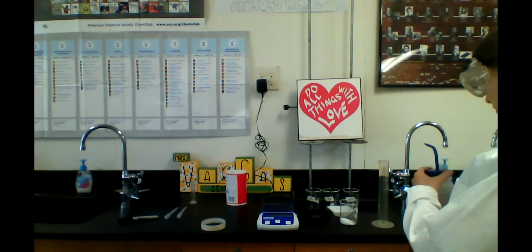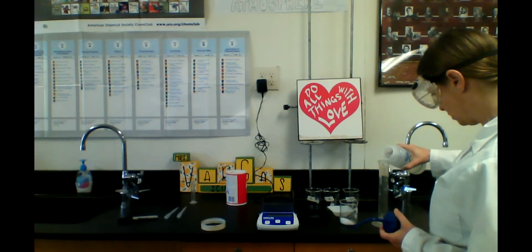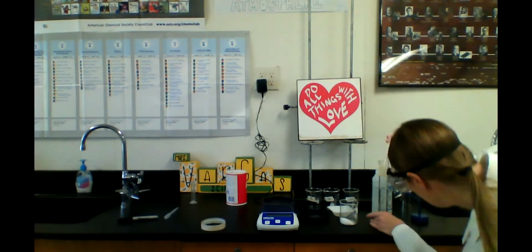And when I get close to the 75 mark, I'll use the pipette, since this is missing the straw. So I'm about 70 right there. Okay, 70. We're going to use our plastic pipettes for the last 5.